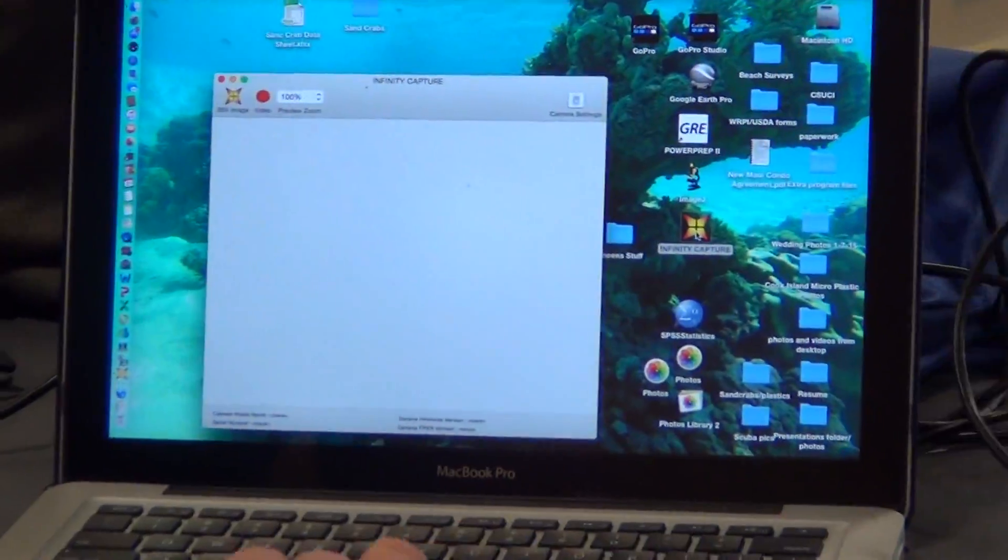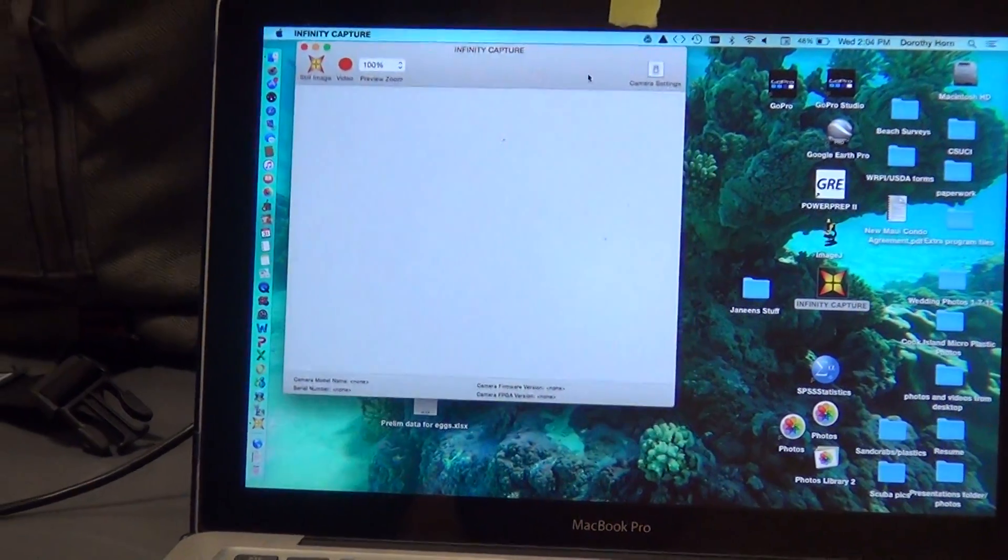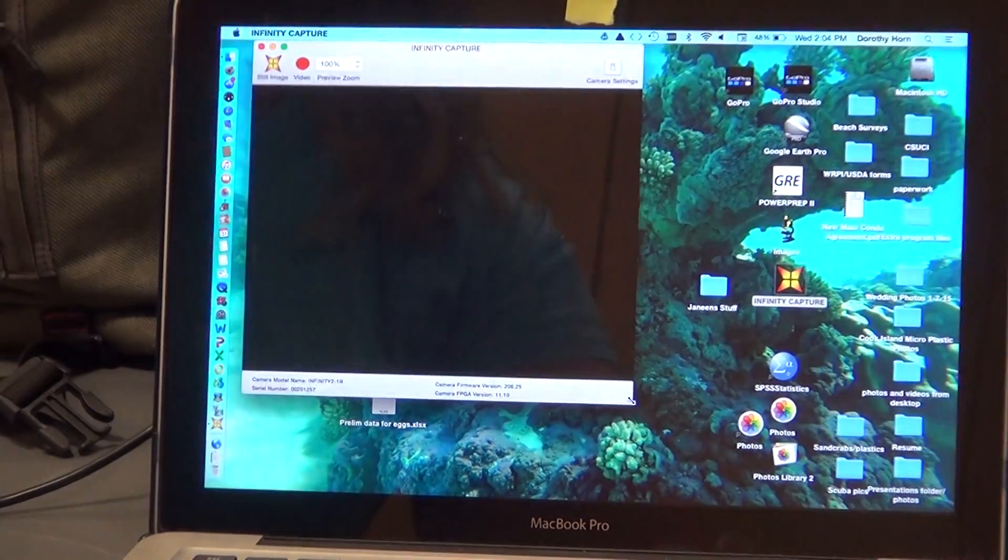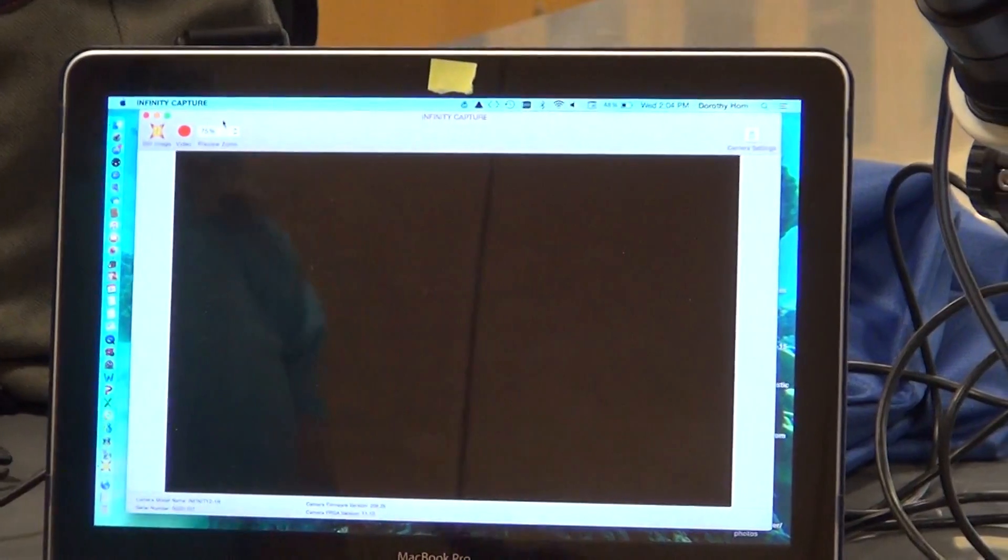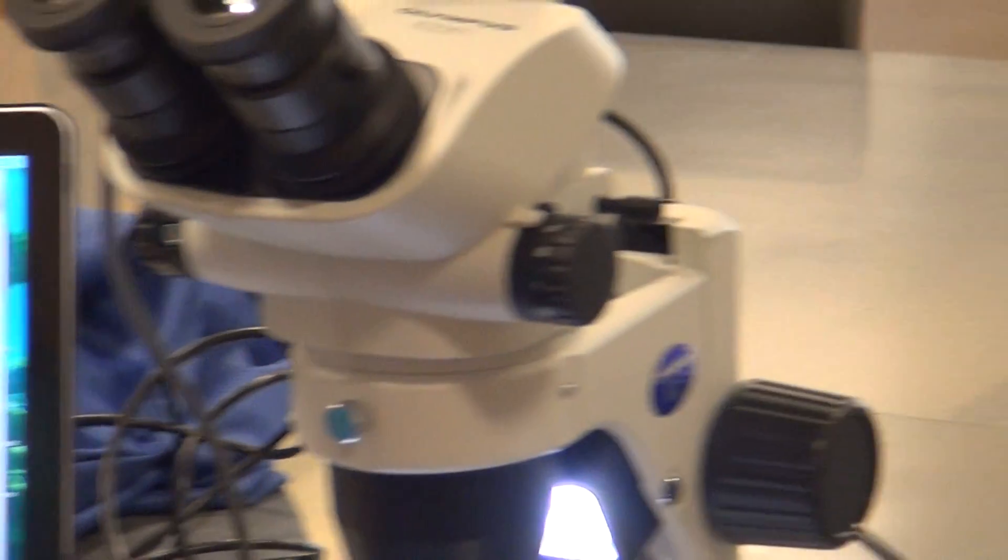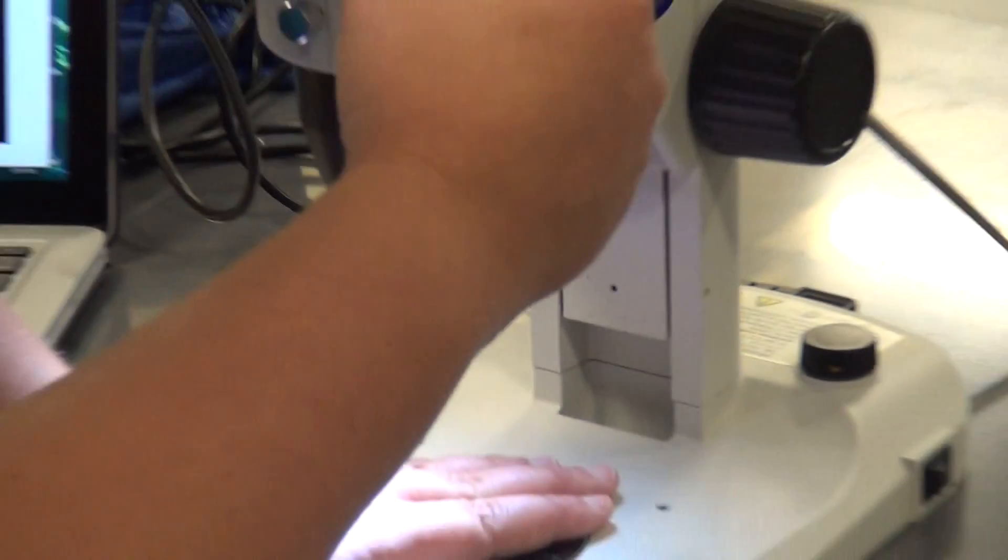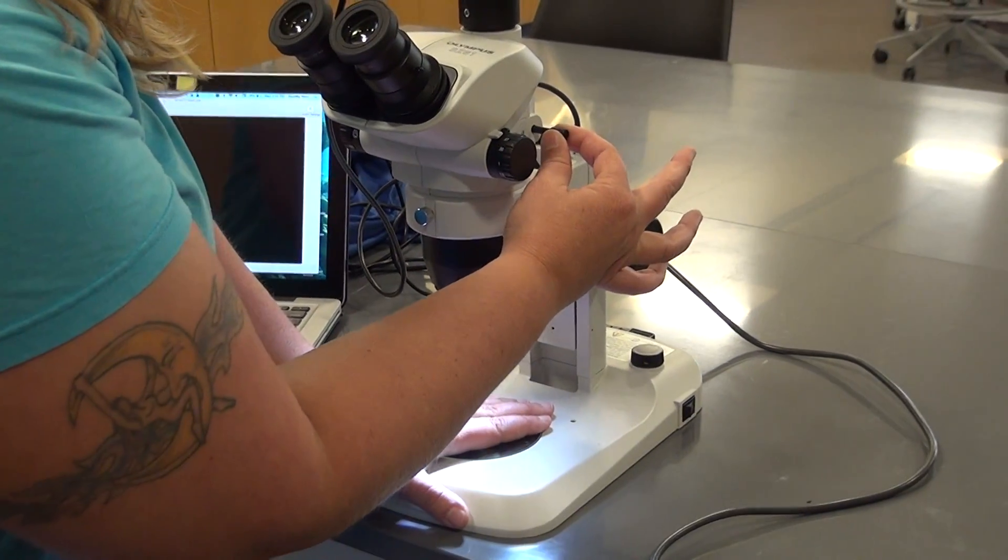It opens pretty fast. You have a window like this. You have a choice. This is at 100%. I personally like to shoot at 75, because you get a better frame in your photo. If you have something on your microscope here, and you're ready to take a picture on the side here, you just pull this straight out.